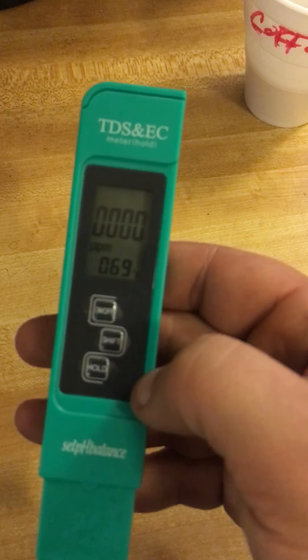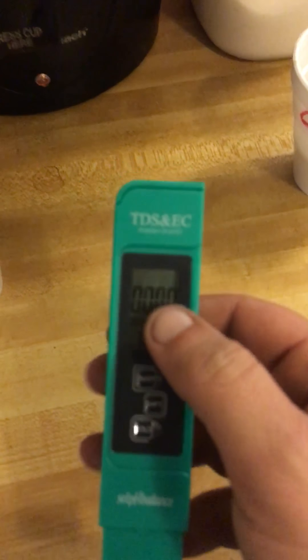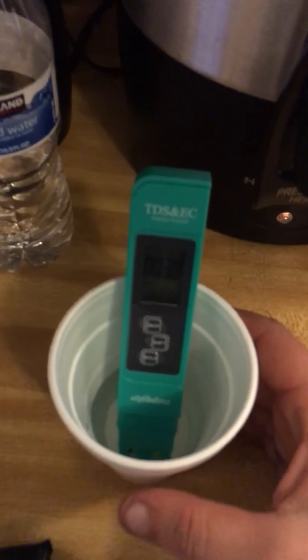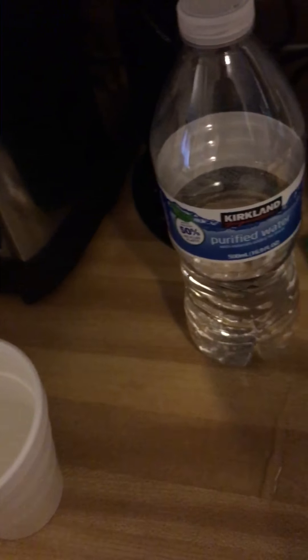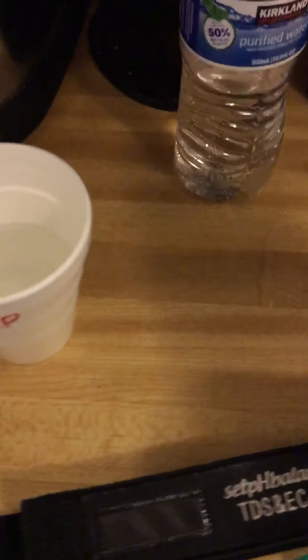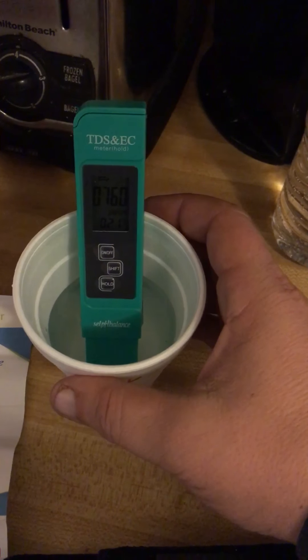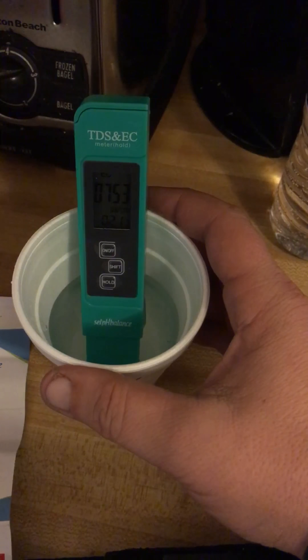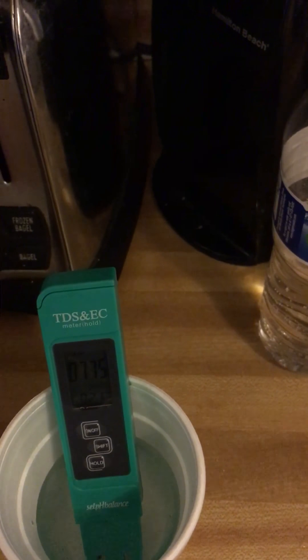It doesn't have a light-up screen — EC, PPM. Let's go ahead and try it. I spilled the water. The bottled water reading seems pretty high. Let's go to the tap water — holy cow, that is actually really high. It's at 77, so that would be quite elevated.